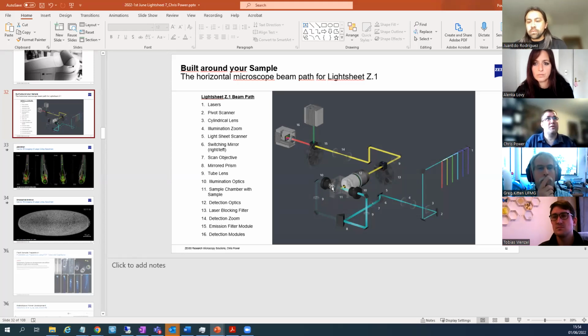On the second question, you talk about, okay, if this is the imaging lens coming from above, you're saying the two sheets here, potentially one's like that and one like that, they might not be in the same plane here.